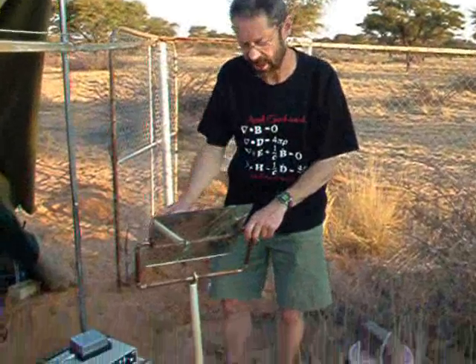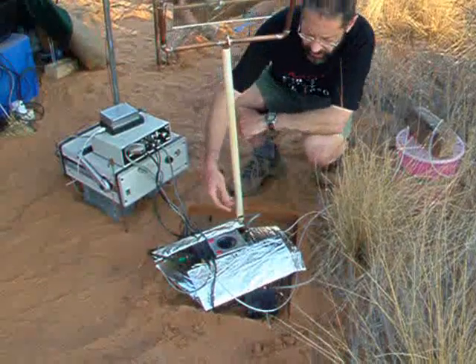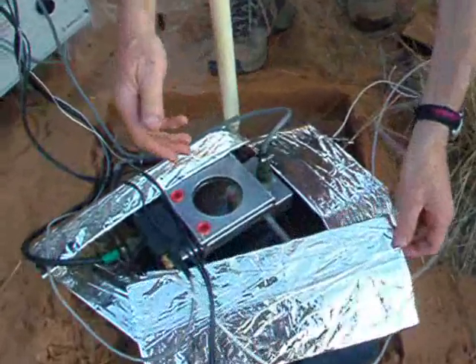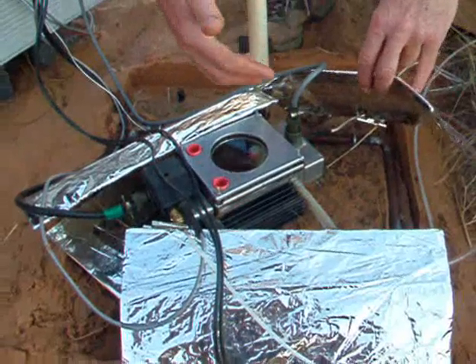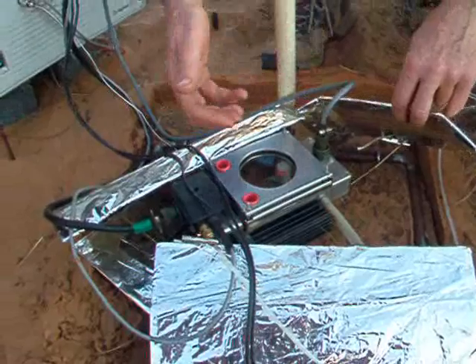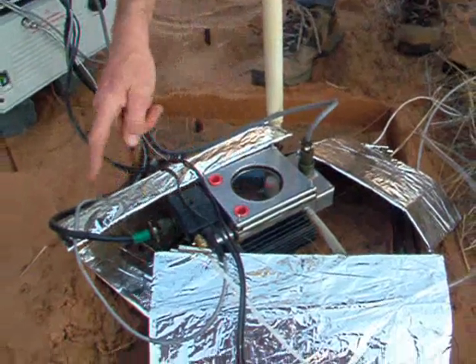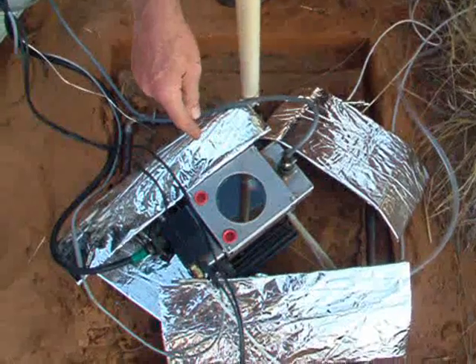This is our gas respiration chamber, which we're using to actually measure gas fluxes coming from the soil. You can see that there's a window because we have to allow for photosynthesis — it's a high transmission window. There are also coolers that keep the cell from getting too hot, because we try to make sure that the environment in the cell is the same as the outside environment. This is why we have lines to purge fresh air into the cell periodically, and lines to purge the gas chromatograph, which also measures the gas concentration.